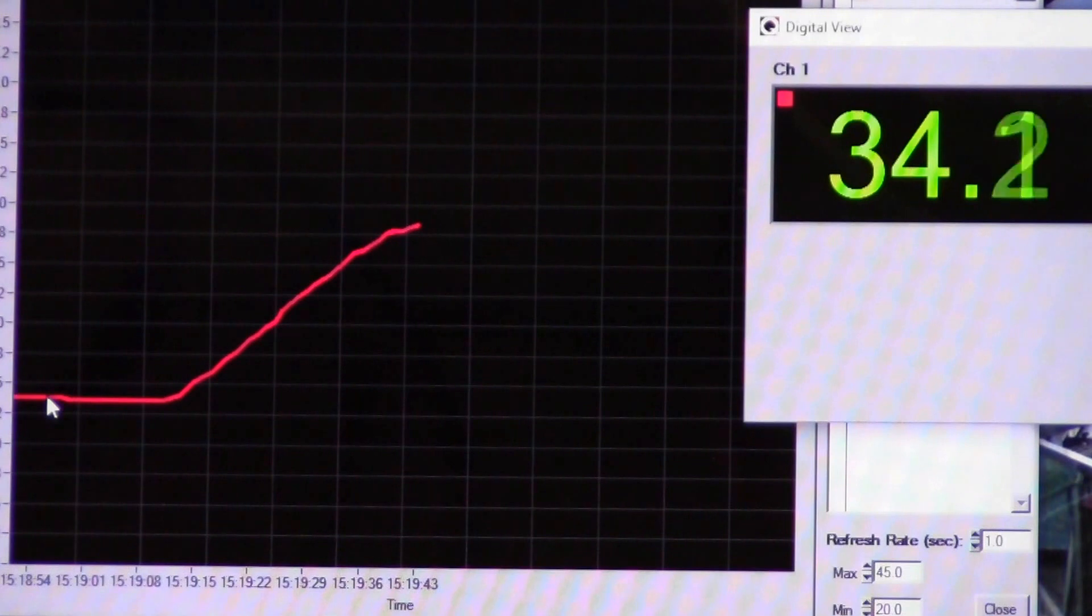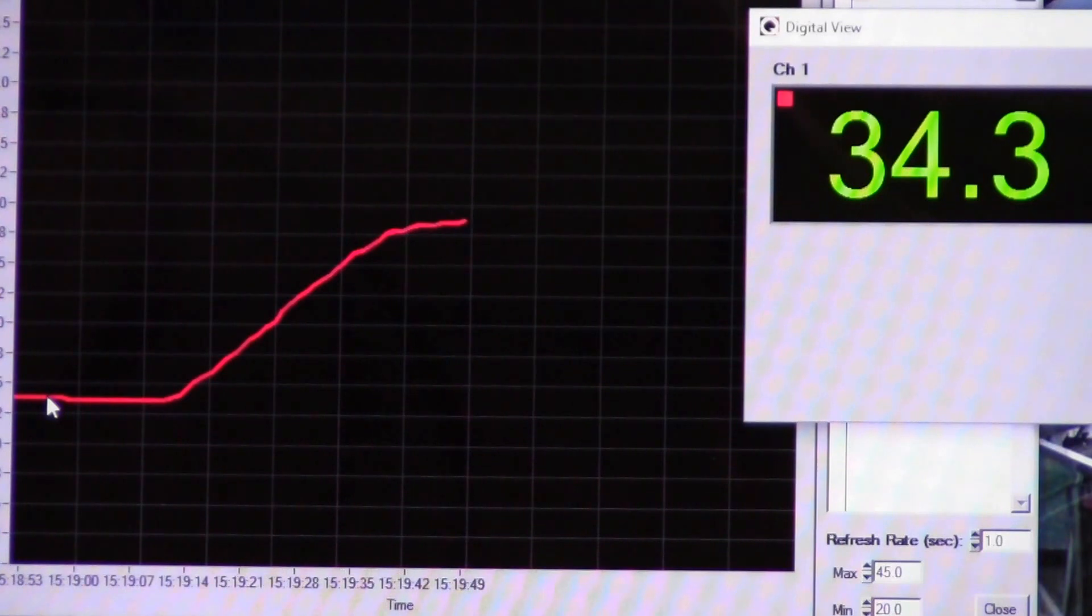It's already starting to slow down. The process is a PID control program that's built into the temperature controller, so it will prevent the temperature from overshooting the 35 degrees.